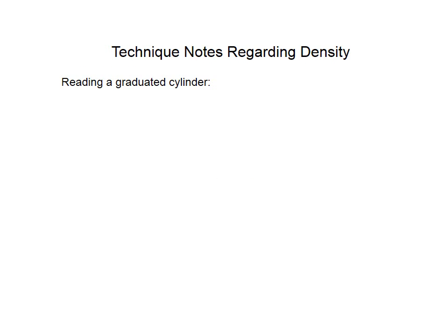I have some notes here regarding using a graduated cylinder. You've used them a little bit. We haven't talked much about how to do that. Your lab instructor may have done that, hopefully, but how do you actually record data from there? One of the things to keep in mind is you always want to estimate one digit when you're reading a graduated cylinder. We'll see that in just a second.